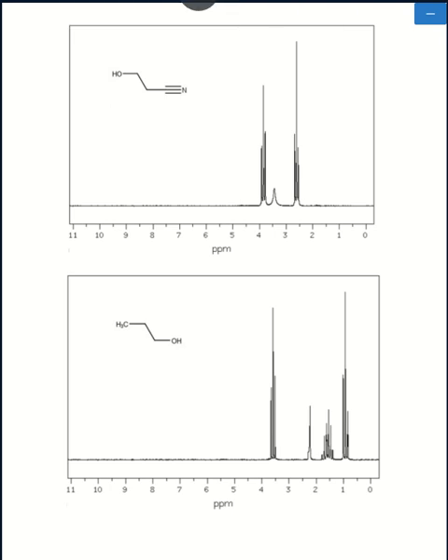In this case, on page 5, there are 3 different hydrogen environments. There is the hydrogen that is part of the OH group, so the alcohol hydrogen. There are also 2 hydrogen coming off of the adjacent carbon where the OH is bound.